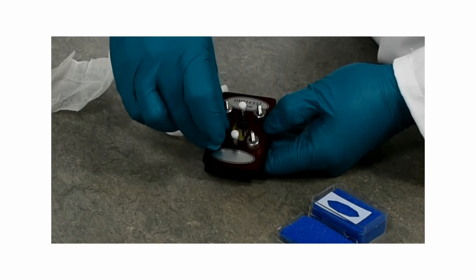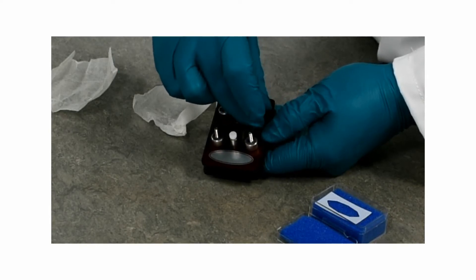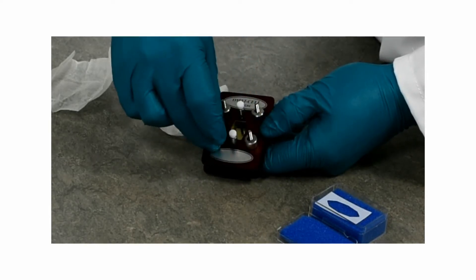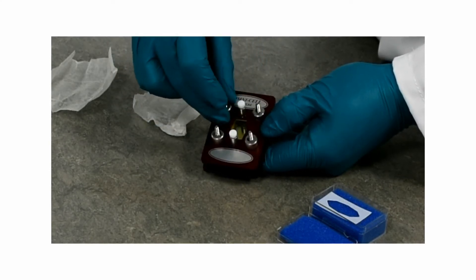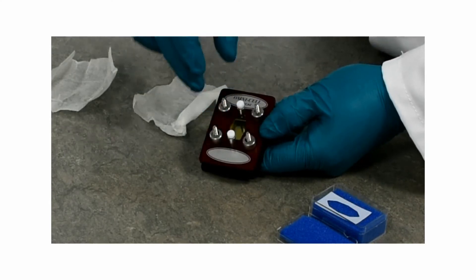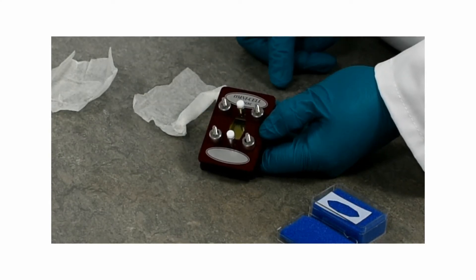If you go in a pattern where you adjust each one a little bit at a time, you help reduce the risk of cracking your window, and once they're finger tight your omni-cell is built and ready for use.